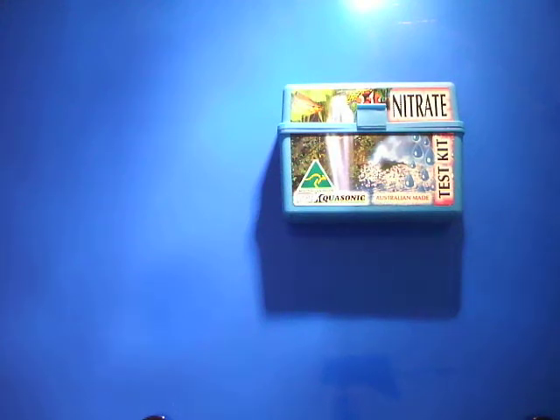Here we have the test kit for nitrate levels for your fish tank, done by Aquasonic — it's Australian made. The point of having a nitrate test kit is that when your fish tank goes through the nitrogen cycle, going from ammonia to nitrite, the end result is nitrate.